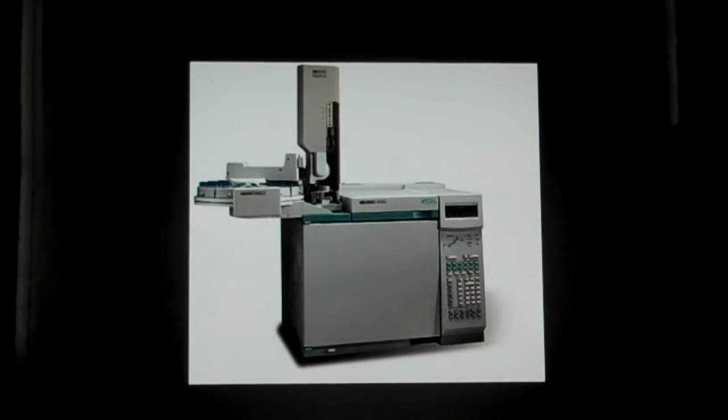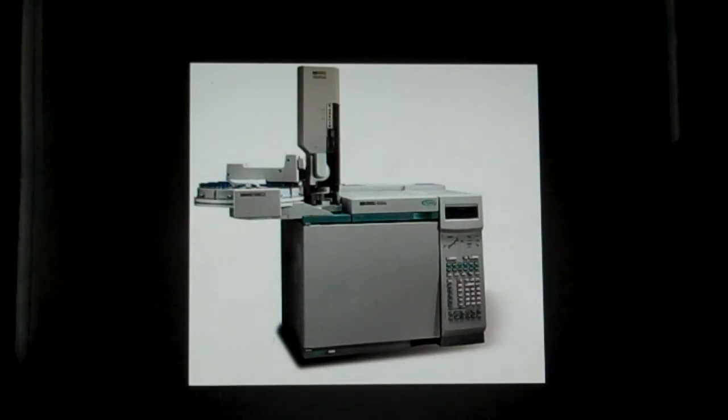Gas chromatography is not considered an absolute means of identification. The reason for this is that another test should also be done to ensure the components of the solution. These substances may have comparable retention times.